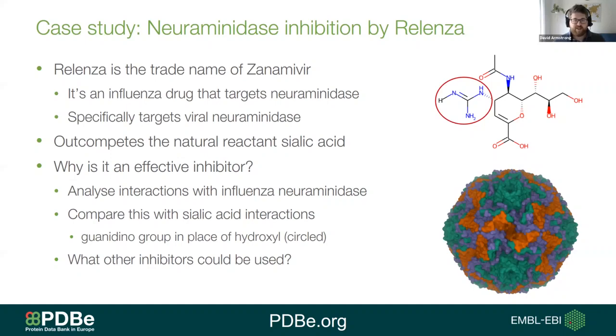This is actually an existing influenza drug that targets neuraminidase in influenza cells. So it's the viral neuraminidase that it specifically targets.